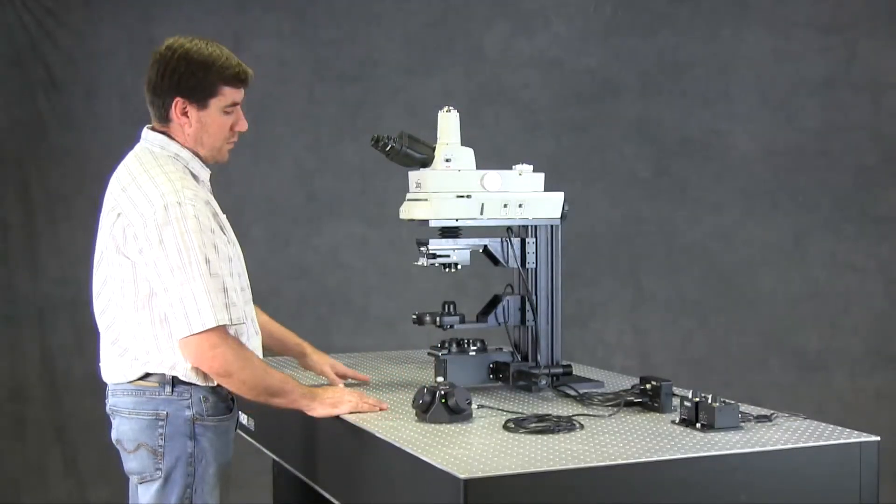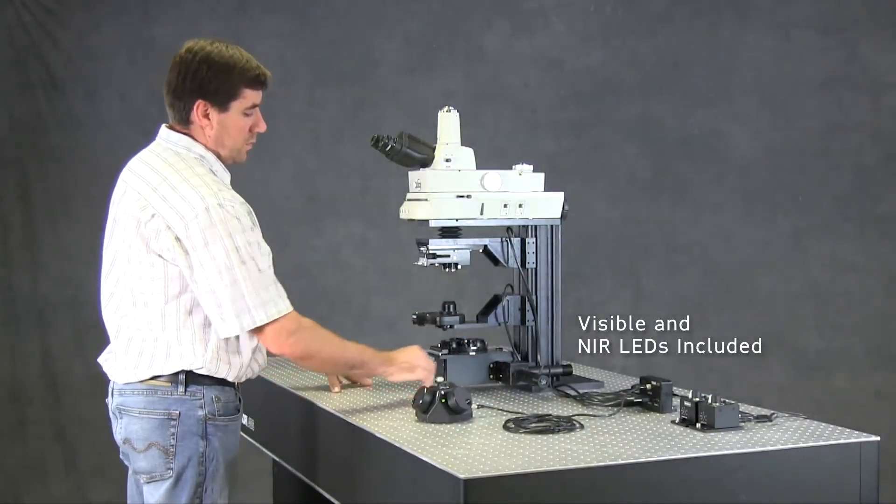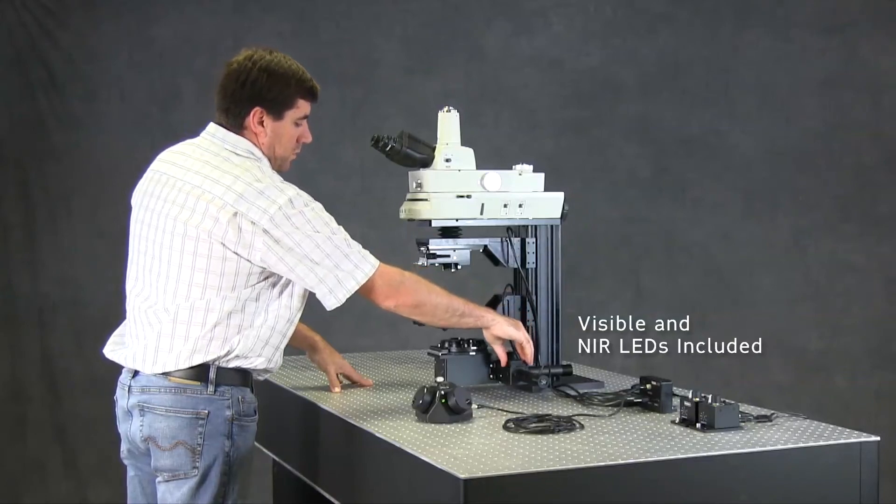For DIC and bright field illumination, we include visible and near-infrared LEDs. A dichroic mirror inside the user-removable filter cube combines the LED's optical output.